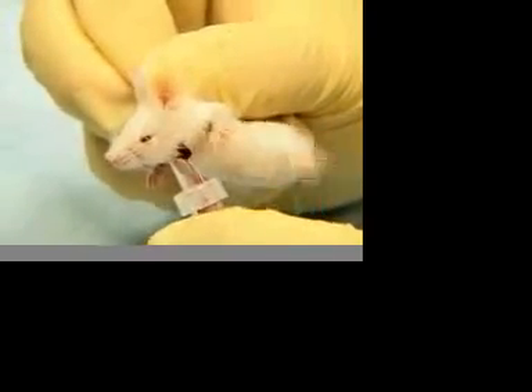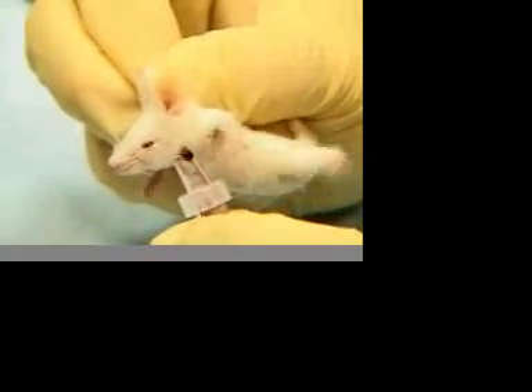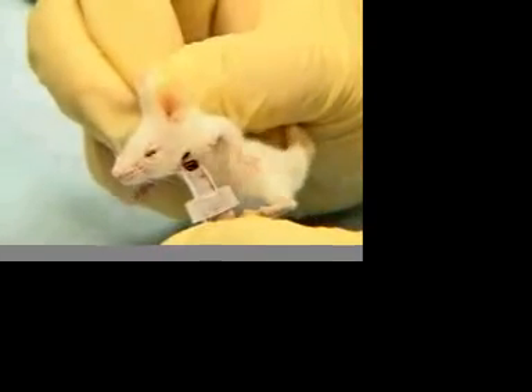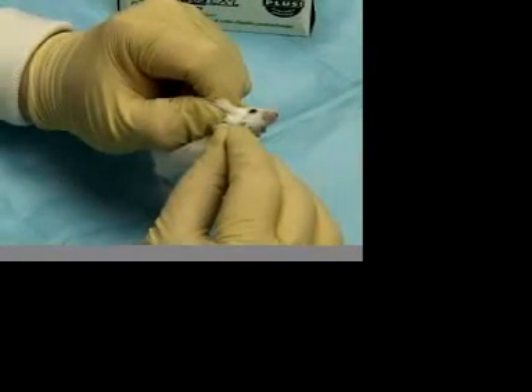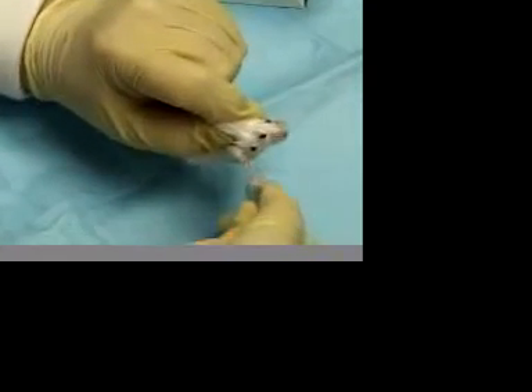You will notice that the animal is unaffected by the procedure. Because the Goldenrod Animal Lancet only makes a small puncture wound, animals can be bled daily or even hourly if only small quantities are needed, by alternating cheeks and targeting a slightly higher or lower location than the previous puncture.